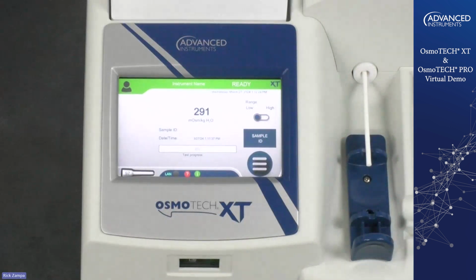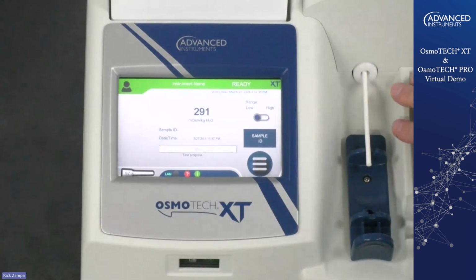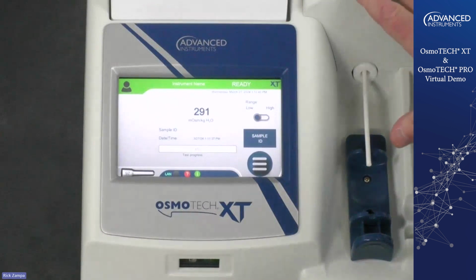It's important to leave that cleaner in there because it reminds the next person who comes up to the instrument, or I should say, it shows them that it's been cleaned. It also reminds them that they should clean the instrument after they're done. So it's very important to clean the instrument after every test. That's basically the only maintenance there is for the instrument. So very easy to use.